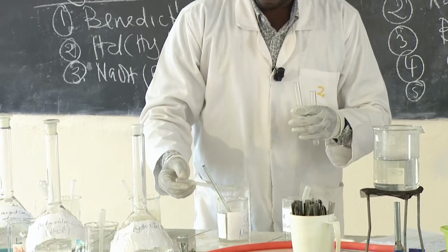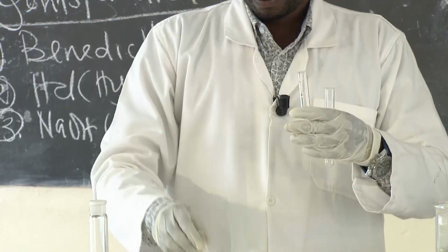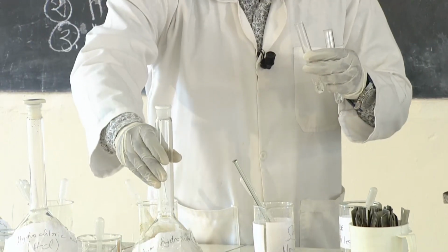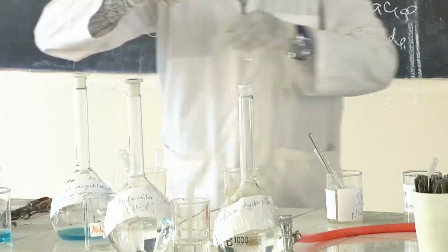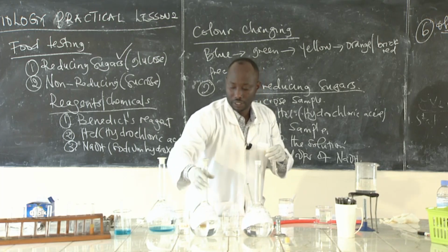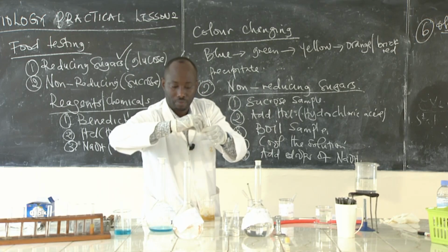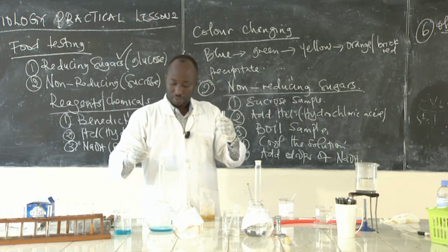I get the sample. After adding it, I add hydrochloric acid. Let me first do one thing. This is sodium hydroxide. This is hydrochloric acid.